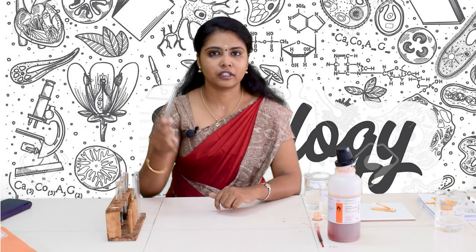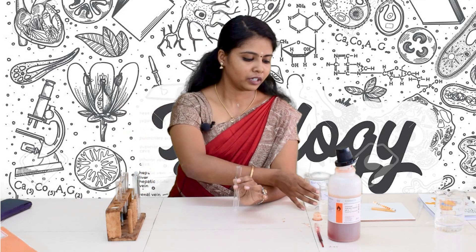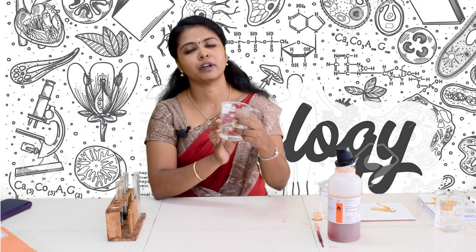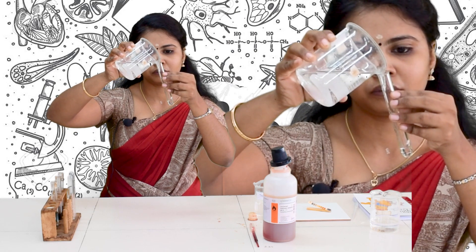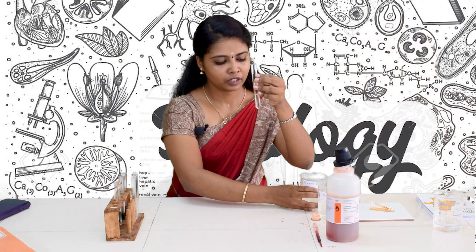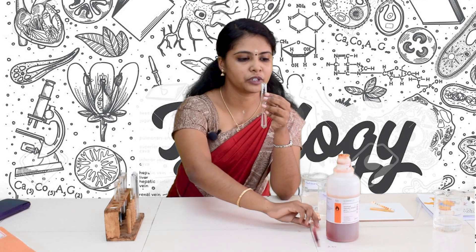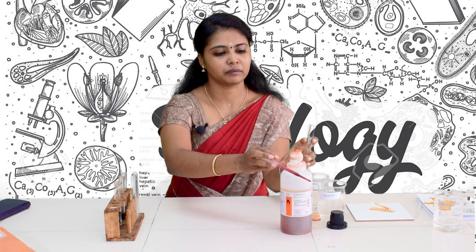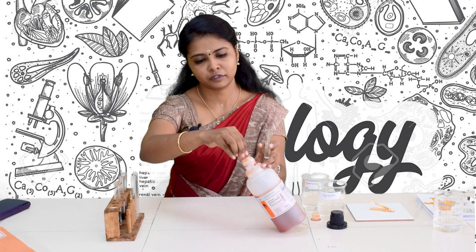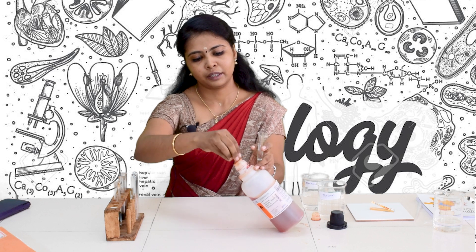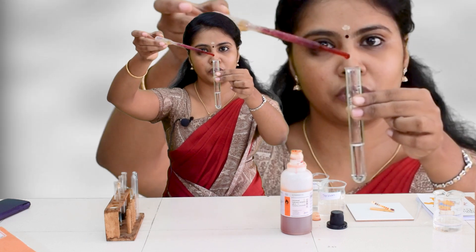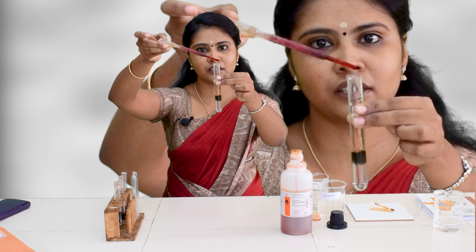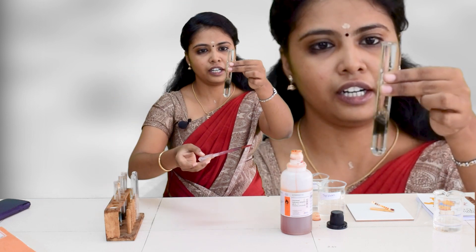First of all, take a clean test tube and add the water sample. We are taking pond water here. Then add one or two drops of the universal pH indicator into the sample solution. Observe carefully — see the colour difference. The colour of the pond water has changed to green.